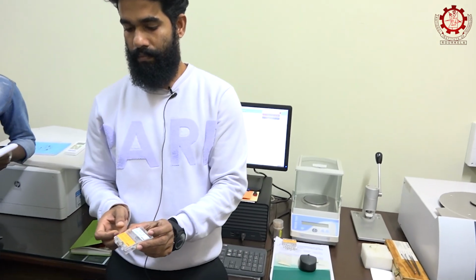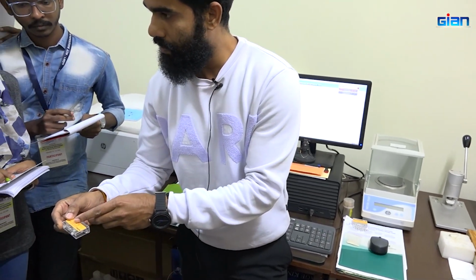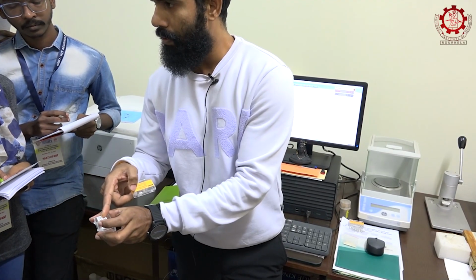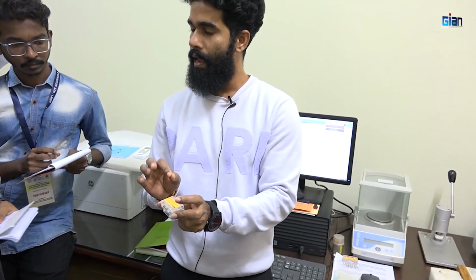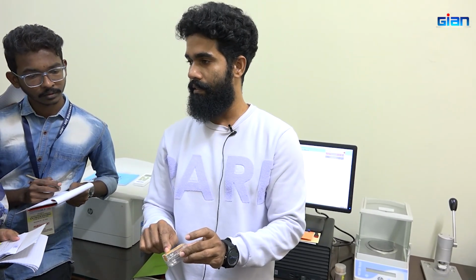See, this is your crucible. This is your lid, meaning cover, and this is your crucible. Here we can put the sample. This crucible and the lid are made of aluminum, and the maximum range of this is 600 degrees Celsius.